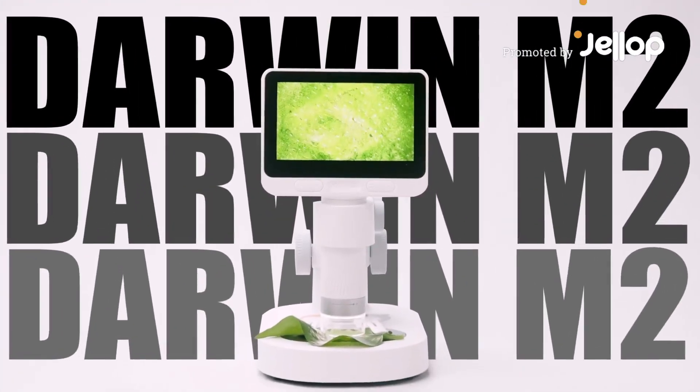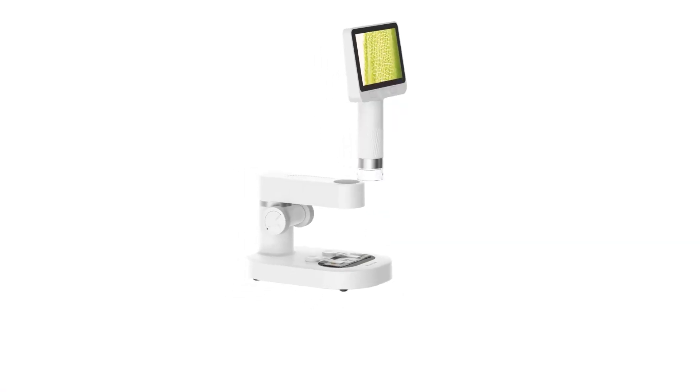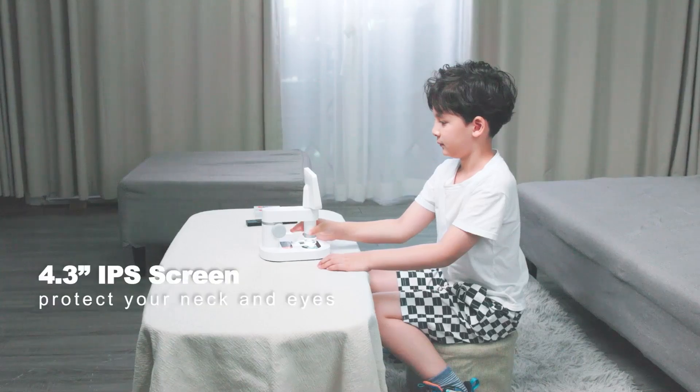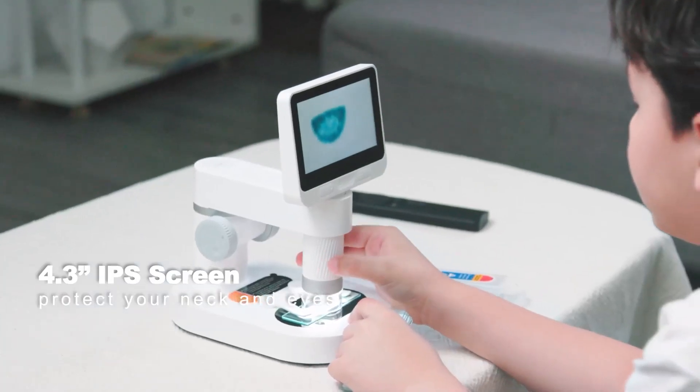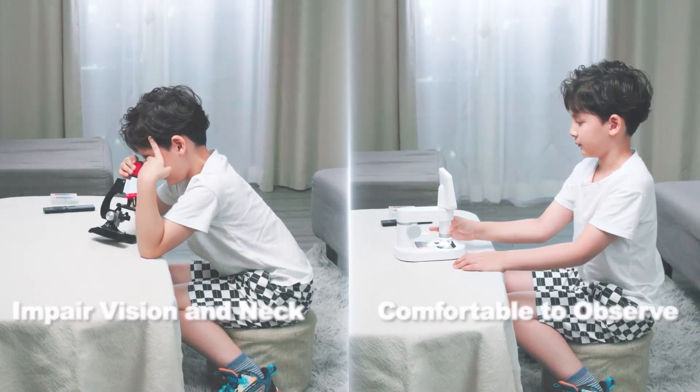Darwin M2, the world's first detachable IPS digital microscope, designed for indoor and outdoor use. With a 4.3-inch IPS screen, making your observations more comfortable and relaxing. Say goodbye to the small eyepiece.